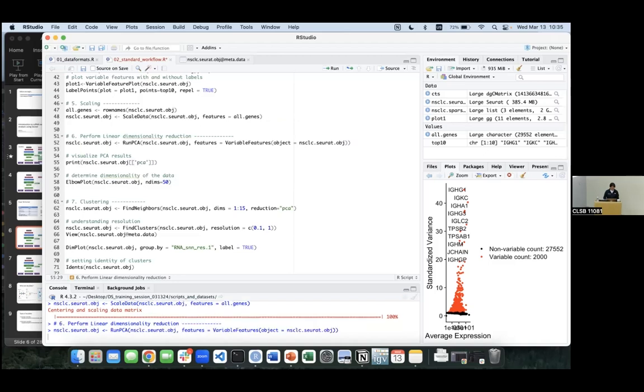Oh, it's finished running. And then you can print out, first check the few dimensions you want to do. Let's for now do 5 here.